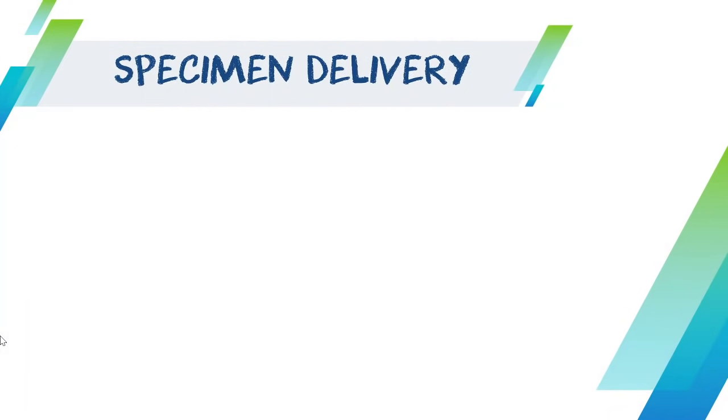Now we proceed to your specimen delivery. So kani, naa na pud tay mga ing-ani na automation here in Davao also. So number one is your courier service. Dati, dili common ning courier service, especially in terms of sending your different samples, especially when it needs confirmatory testing.